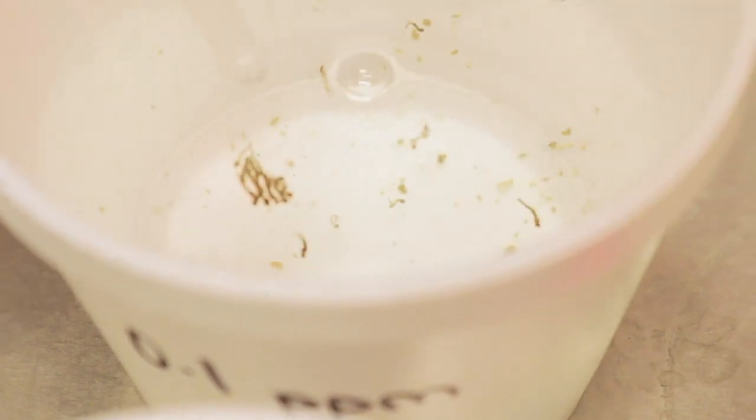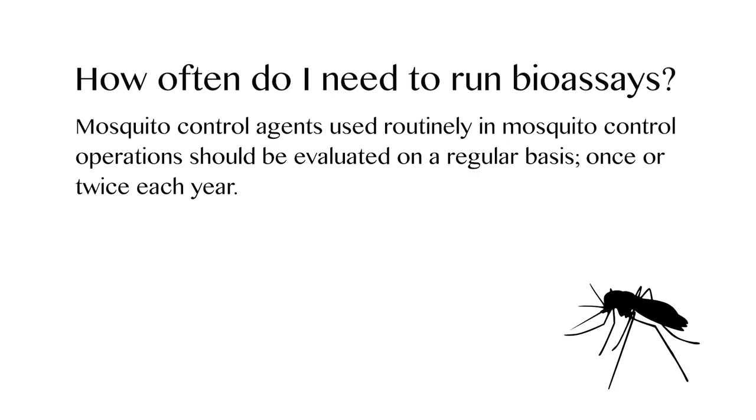How frequently do I need to run bioassays? Mosquito control agents used routinely in mosquito control operations should be evaluated on a regular basis. Bioassays are run to establish the baseline level of resistance in local mosquito populations to a new product to be incorporated into a mosquito control program.